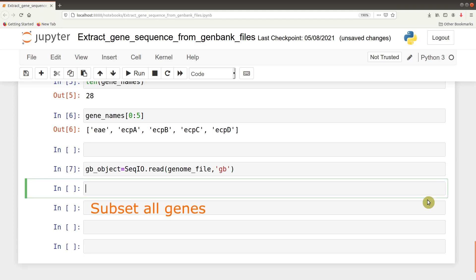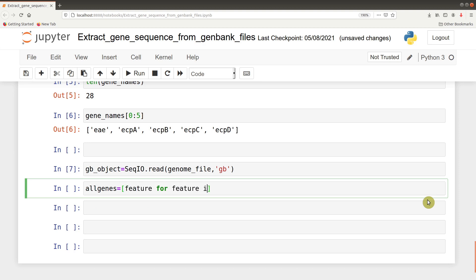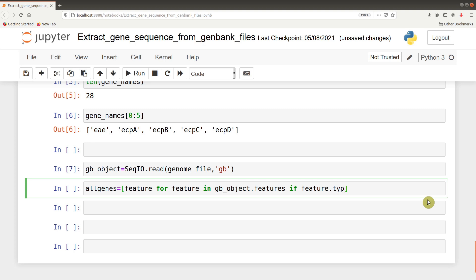The next is to extract all the genes from this particular GenBank object that we have read. So we say all_genes equals [feature for feature in gb_object.features if feature.type equals gene]. What we are doing is extracting all the features that have the type gene.